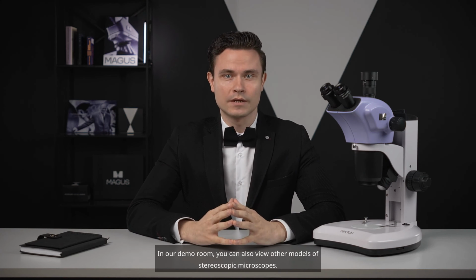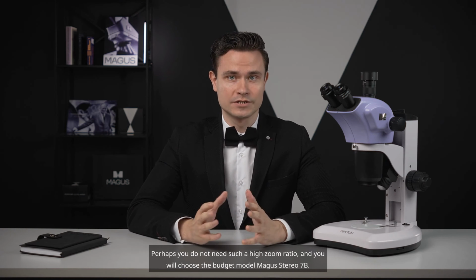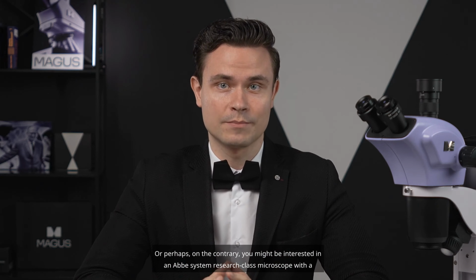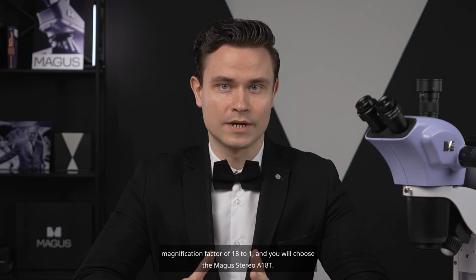In our demo room, you can also view other models of stereoscopic microscopes. Perhaps you do not need such a high zoom ratio, and you will choose the budget model MAGUS Stereo 7B. Or perhaps, on the contrary, you might be interested in an Abbe system research class microscope with a magnification factor of 18:1, and you will choose the MAGUS Stereo A18T.